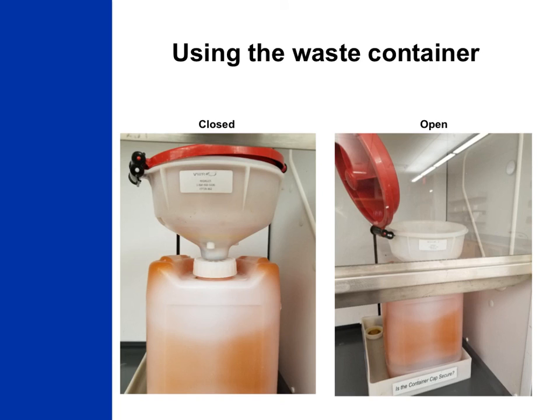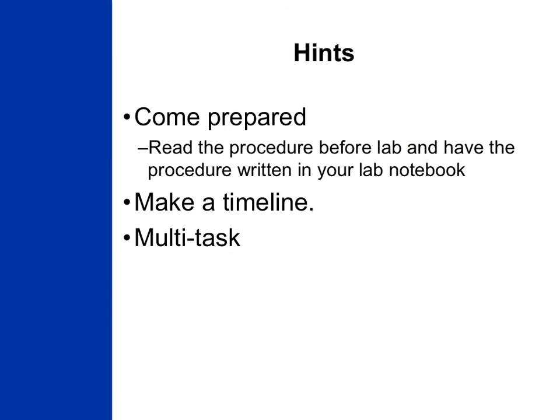Please double check before you pour your waste into the waste container that the funnel is open or in the up position as shown on the right and not closed as shown on the left. When multiple students pour waste into the closed lid of the funnel, it becomes not only a safety hazard for others in the lab, but also a serious safety hazard that has resulted in injury of our personnel trying to prepare your labs.